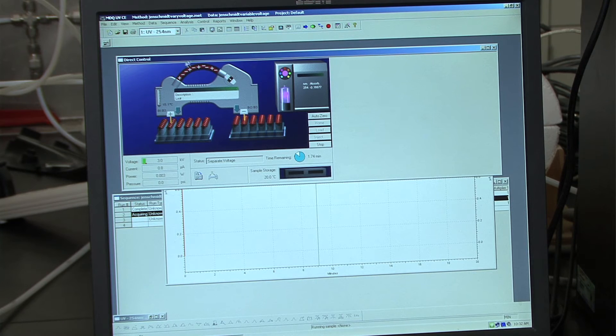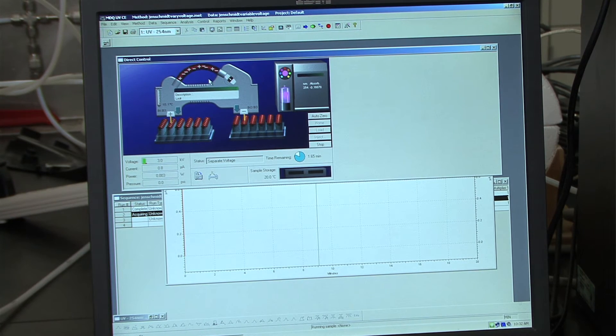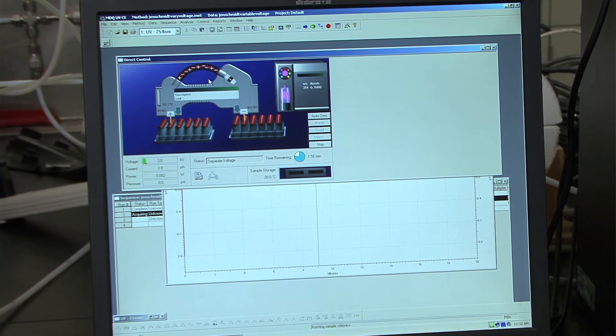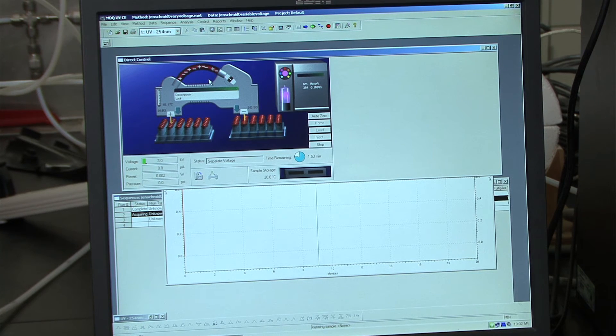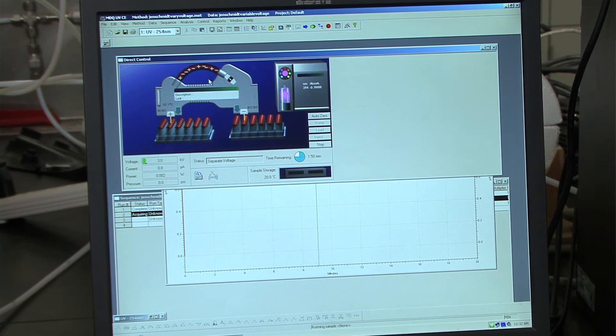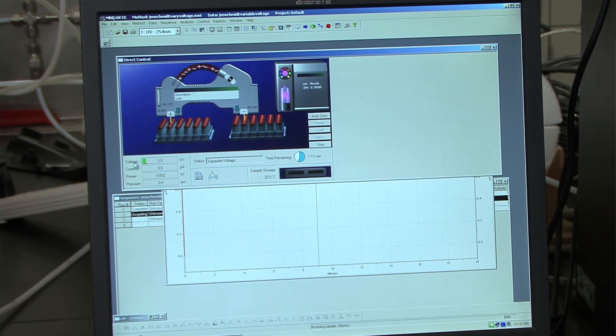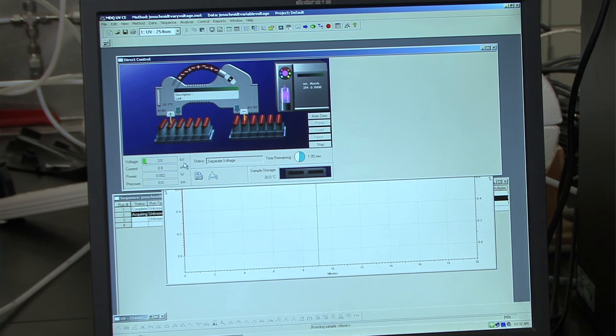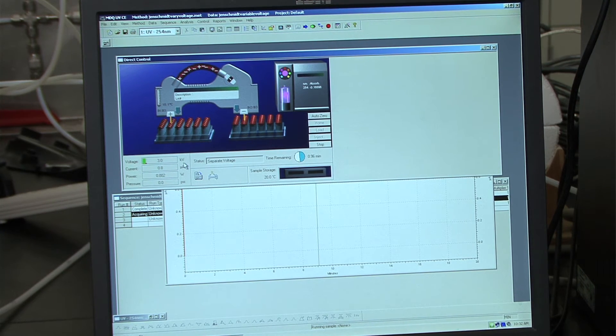As you notice, you see some charges here in the capillary. And this indicates the separation of charges that are present in your sample. If you notice here, the voltage is at 3 kilovolts. And if you recall back to your method, that is the first voltage parameter that was tested.